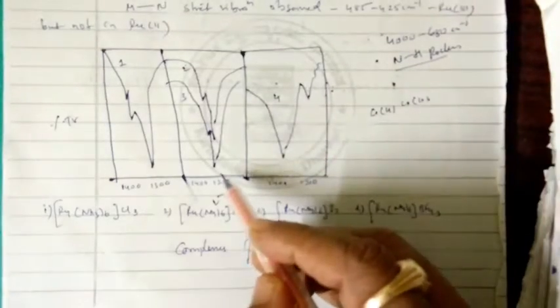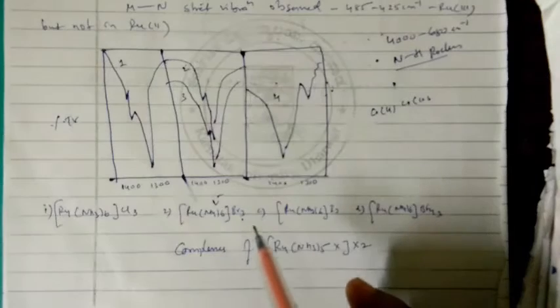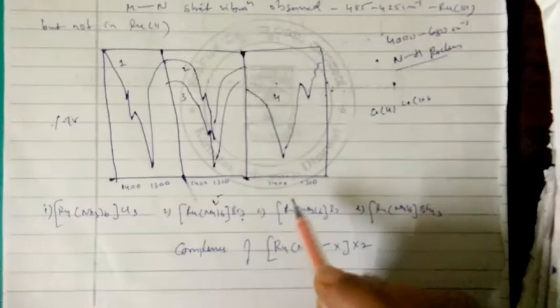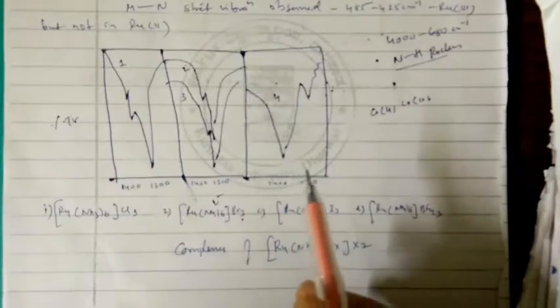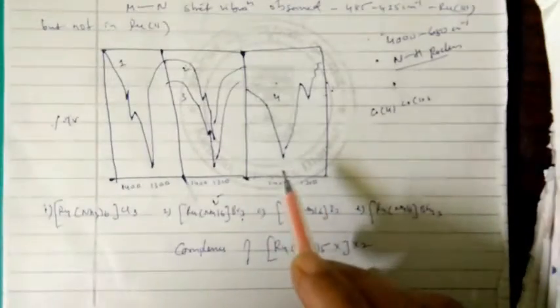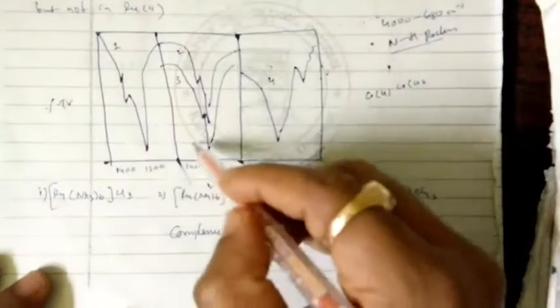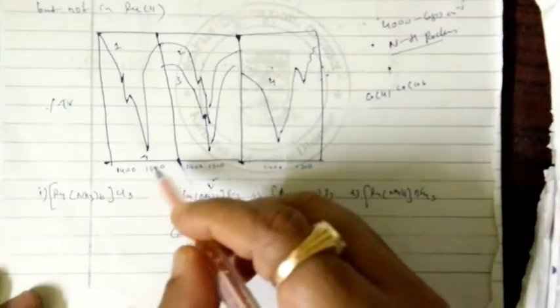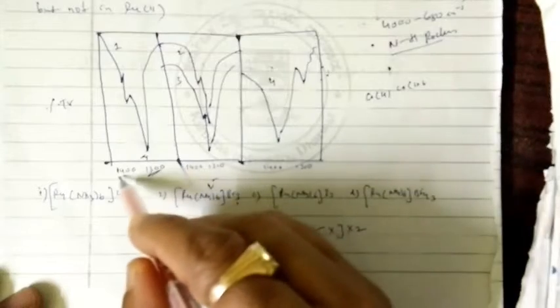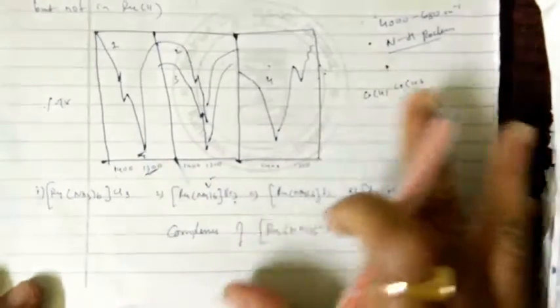These are the ruthenium 2 complexes and the Cl3 type trihalide complexes, reported in KBr. In this medium you can see only one NH3 deformation band, observed at 1313, symmetric.